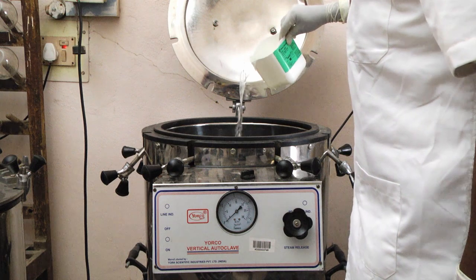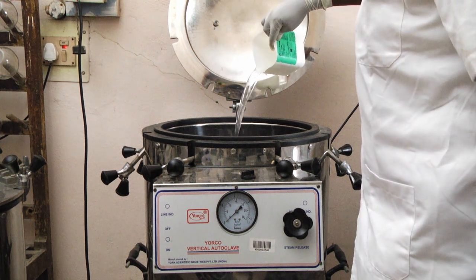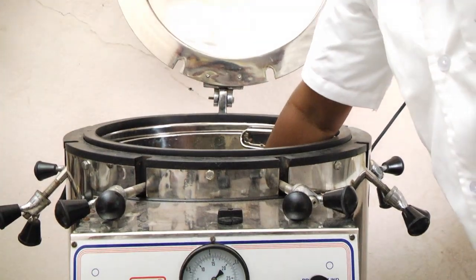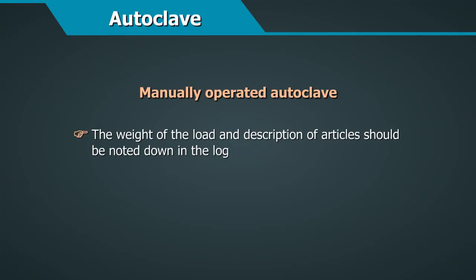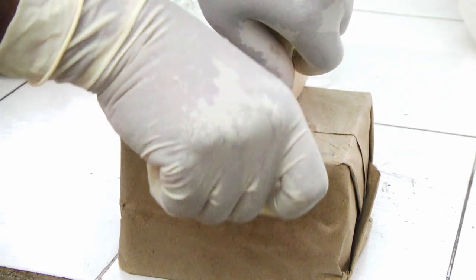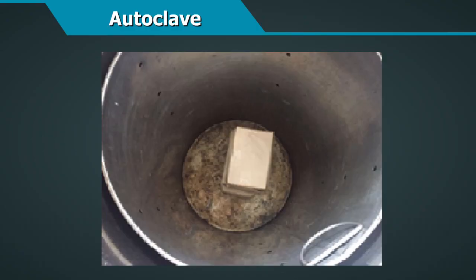When using a manually operated autoclave with thermometer and pressure gauge, add the correct amount of water as directed by the manufacturer. When loading, leave sufficient space between articles for steam to circulate freely. Do not allow articles to touch the sides of the chamber or stand in water — use a tray or wire stand at the bottom. Note the weight of the load and description of articles in the log, and place a control time-steam-temperature indicator strip in the centre of the load where steam penetration is likely to be slowest.